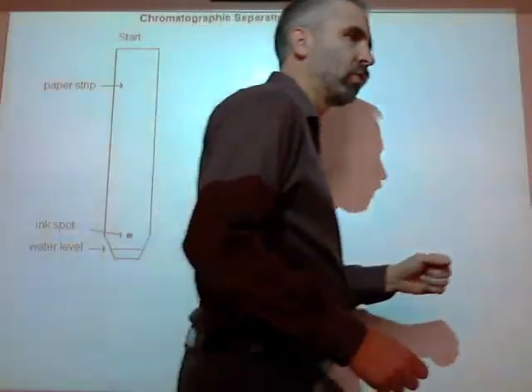All right. So look at your paper here. Let me show you how you start it and then what happens. You're going to fill up. It's going to be a plastic tube. As a matter of fact, I should probably get it so I can show you because your thing is going to be tomorrow.